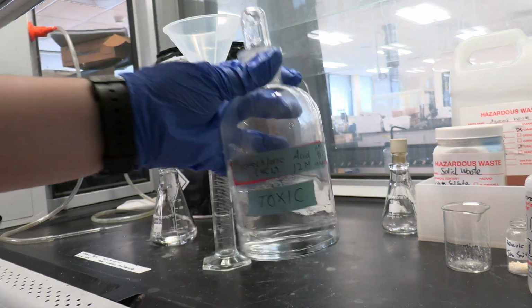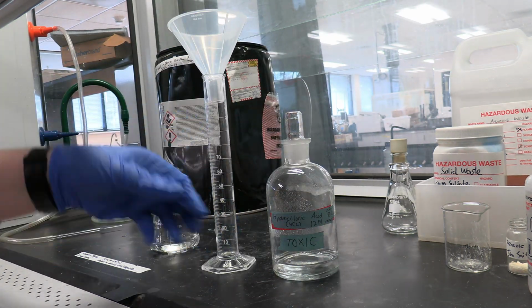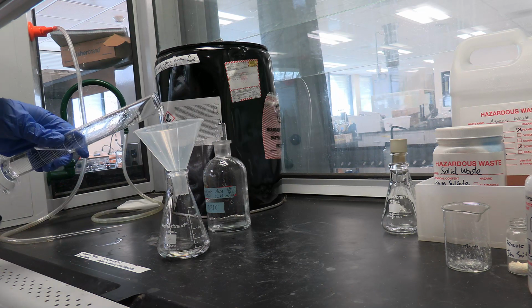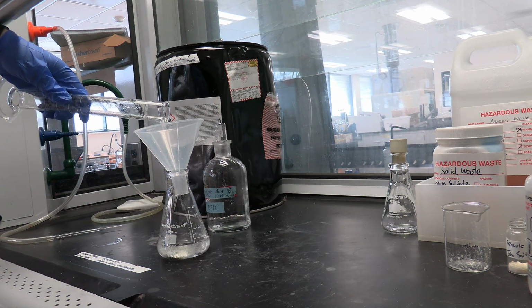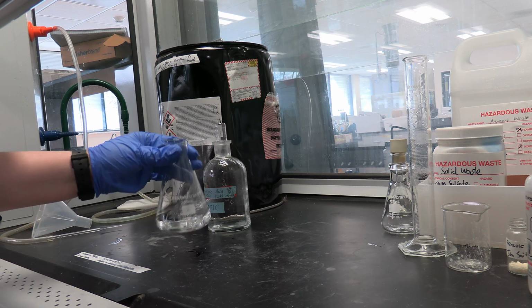Now, to make the hydrochloric acid, it's a much simpler process. There's a cabinet for acids next to the materials cabinet in the lab, and there's a section for hydrochloric acid entirely. Here, I have 12 molar hydrochloric acid, and to decrease the molarity by half, I just need to measure out half the total milliliters I need, which is 60, and then add that to 60 milliliters of water to make the molarity 6M. The benchmark rule is to never add water to acid, but you can add acid to water. I'm doing this through a funnel to make sure there isn't any spilling.